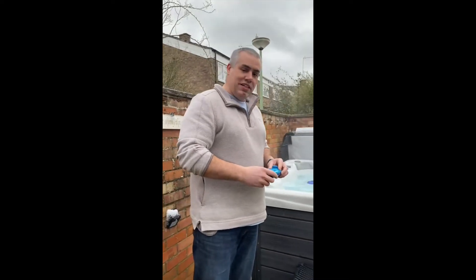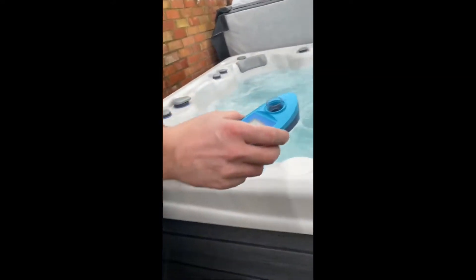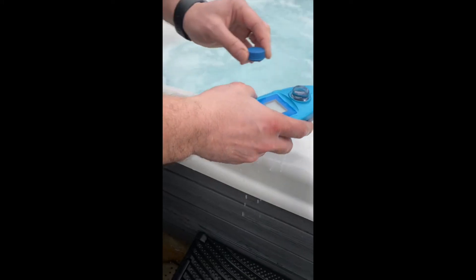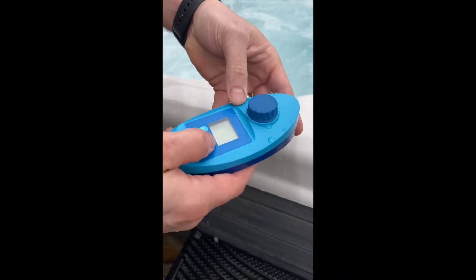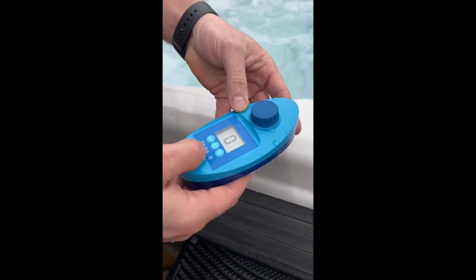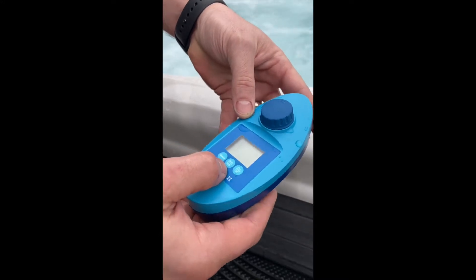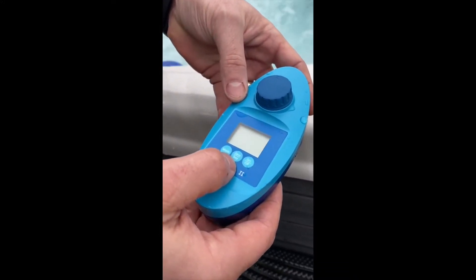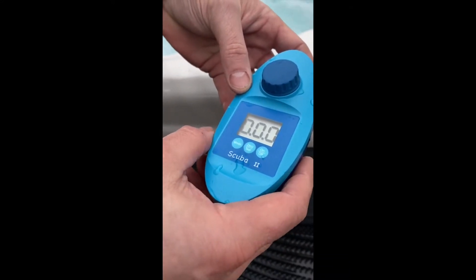So here's our hot tub and the first thing we're going to do is take the samples. We can take the lid off and dip it under the water, as you can see, and then put the lid back on. The first thing we need to do is zero it by pressing the on button and then pressing the zero button in the middle. It'll start to flash, and then when it goes to a solid zero that's us calibrating. Now we're ready to do our samples.